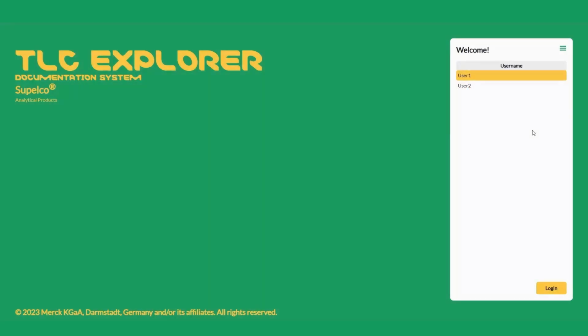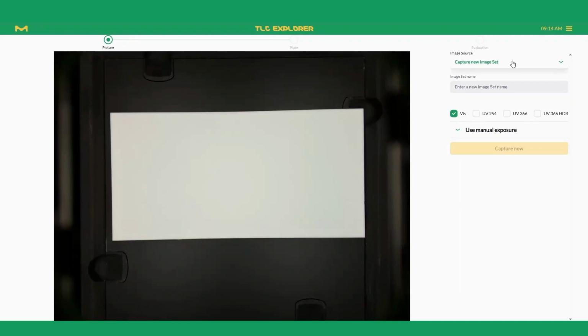To take a picture, select a user and press the Login button. On this screen, you will see a preview picture of the plates which are placed in the Explorer. With the drop-down menu, you can choose between capture a new image set or have a look at previously generated image sets by choosing Load Image Set.